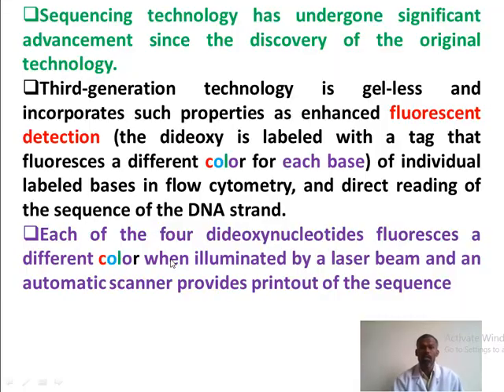Sequencing technology has undergone significant advancement since the discovery of the original technology in 1970s, which Sanger discovered. And now there are third generation technologies, which are gel-less. So we don't need to run a polyacrylamide gel. Instead, scientists added fluorescent detection to the dideoxynucleotides, where each dideoxynucleotide produces a different color.